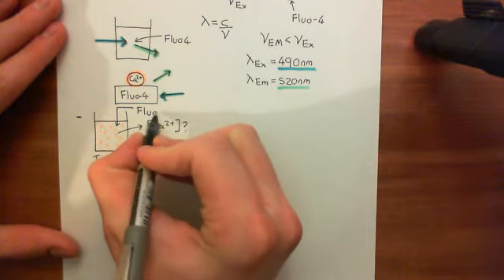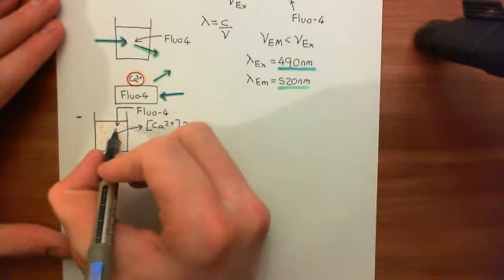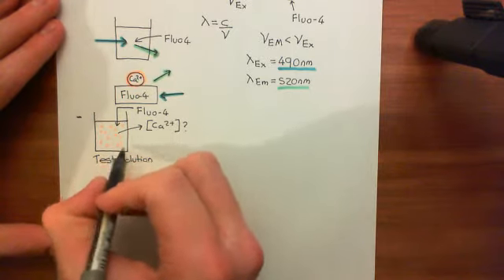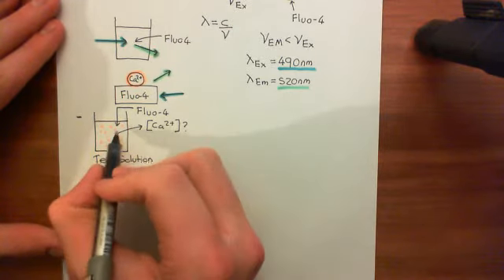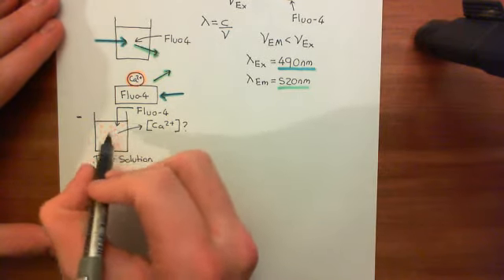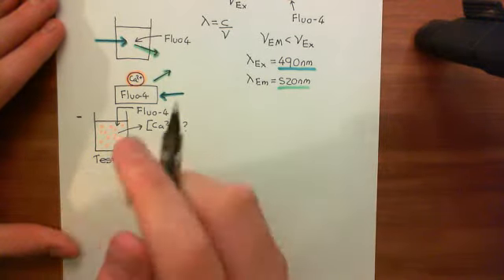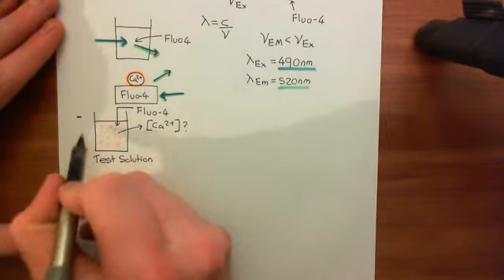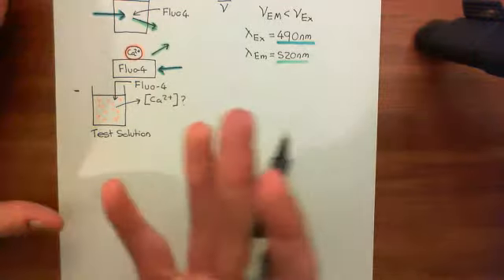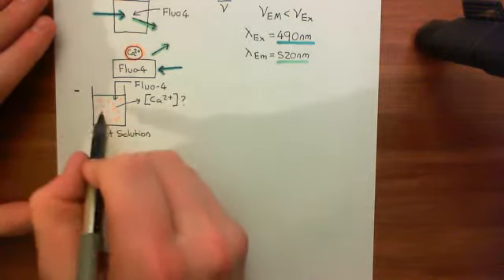So this is why it's a better way of doing it, because even if you try to make sure that you put in a certain amount of Fluo-4, you have to make sure that the concentration's correct. So there's an error in your amount of Fluo-4 that you put in. There's also the error of the volume that it'll be, and therefore the concentration it'll be. So there's a better way of doing it than trying to get an exact concentration of Fluo-4 within this solution. Basically just add in Fluo-4 willy-nilly. I don't care how much you add in. So put in your Fluo-4.